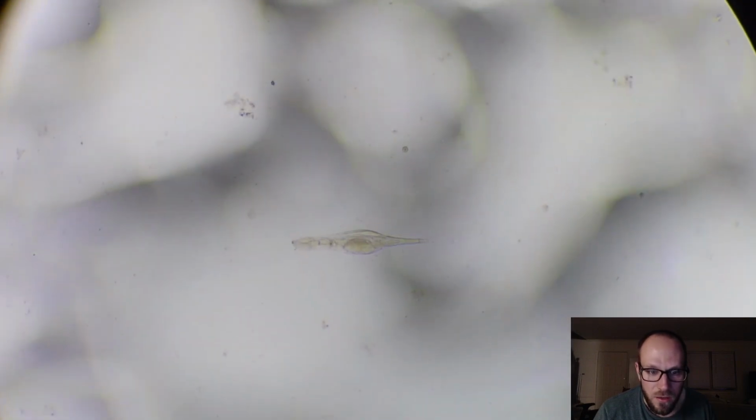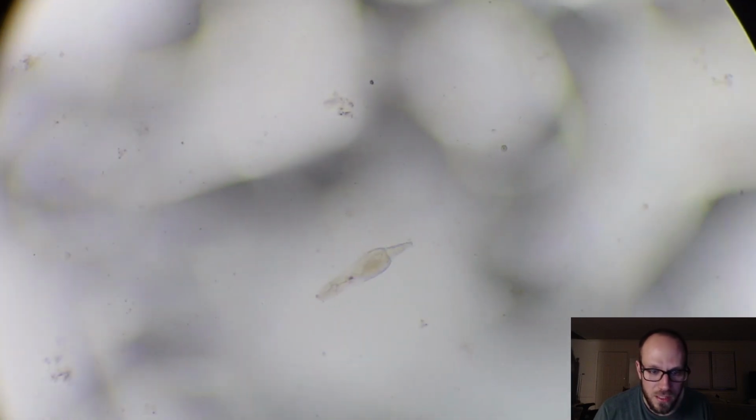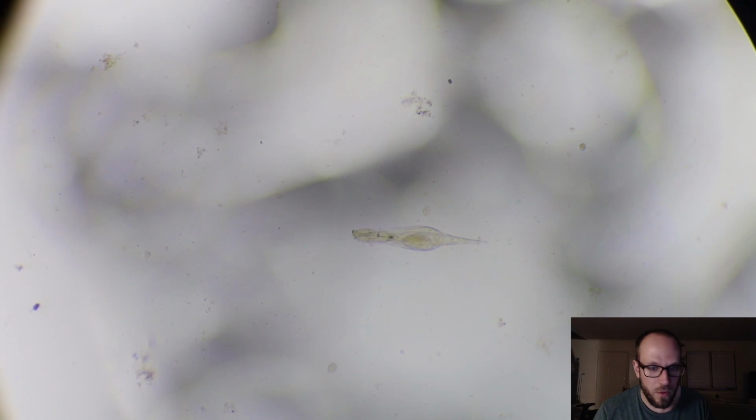But yeah, he's just searching for food. You can see his organelles. When he starts actually filter feeding, you will see his little jaws open and close. I want even more contrast. Yeah, that damn water is getting on my nerves.